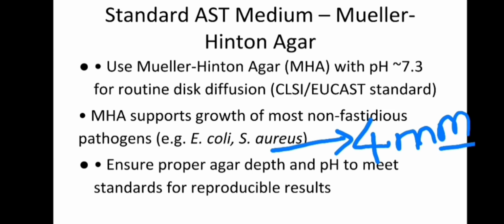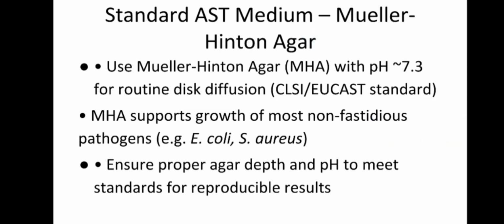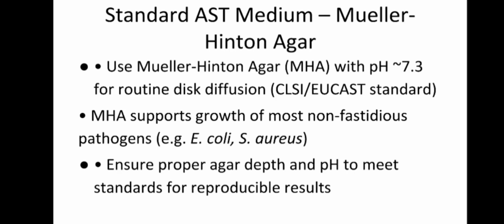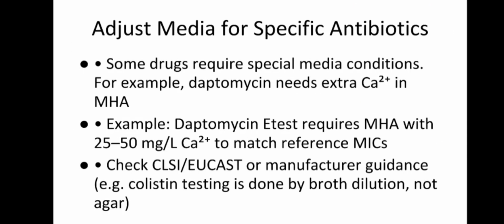If testing a non-standard organism, check whether a supplement like blood is needed. When you're testing an organism that is not standard or unique, or you have isolated something new, you know in which medium the bacteria grow better, and it doesn't require supplements in your initial culture. So you can just transfer it here, like they've added for this chocolate agar, right? Just have Mueller-Hinton agar and add a supplement for the bacterial growth. Okay, moving on.